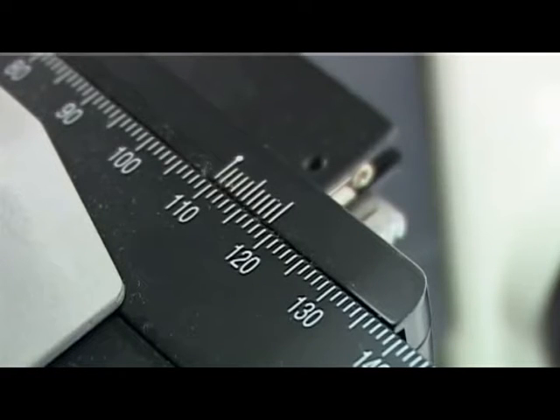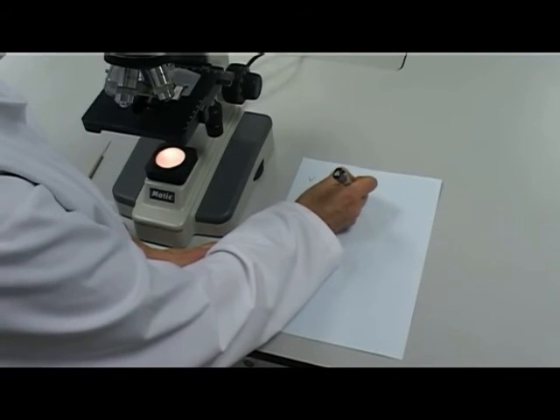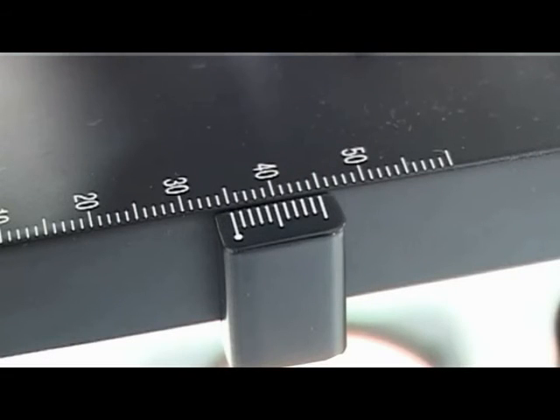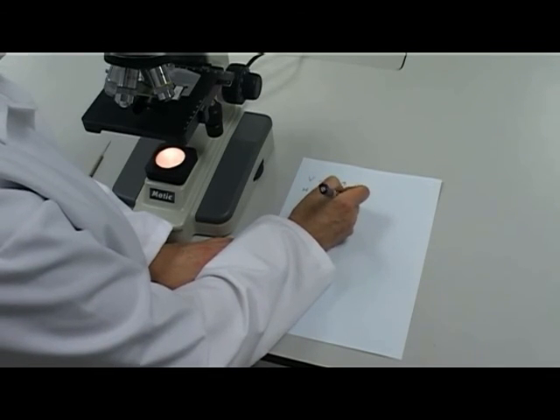To read the vertical vernier scale, take the first division on the main scale that corresponds to the zero on the small vernier scale. If, as in this example, the zero falls between two divisions, take the lower reading. Take the second reading from the first point at which a division on the small vernier scale corresponds exactly with the division on the main scale. Record your reading — in this example, 109.6. Read the horizontal vernier scale in the same way. Record your reading — in this example, 35.3. You have now read the vernier scales correctly.